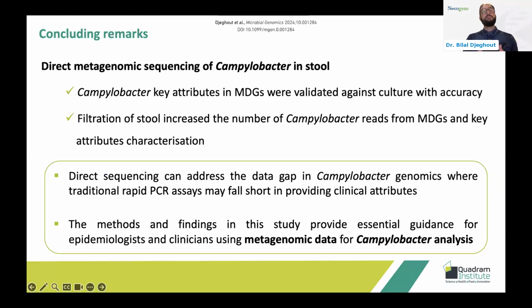So in conclusion, direct metagenomic sequencing of stool samples has proven to be a powerful tool for Campylobacter analysis. First, we validated key attributes of Campylobacter in metagenome-derived genomes against culture results, demonstrating high accuracy. Furthermore, our filtration approach significantly increased the number of Campylobacter reads from the MDGs, enhancing the characterization of key attributes.